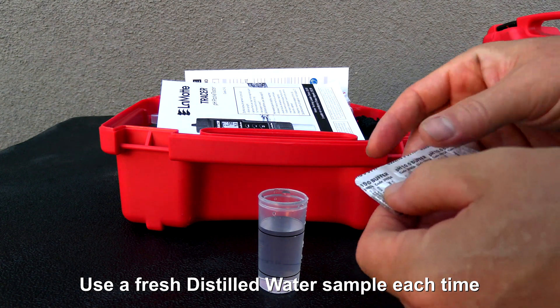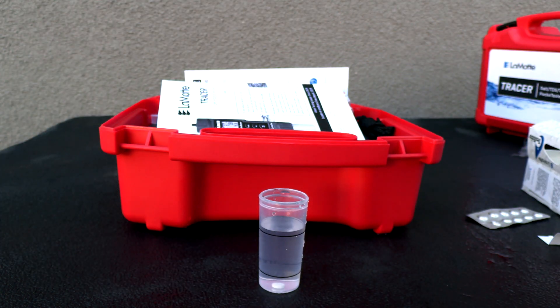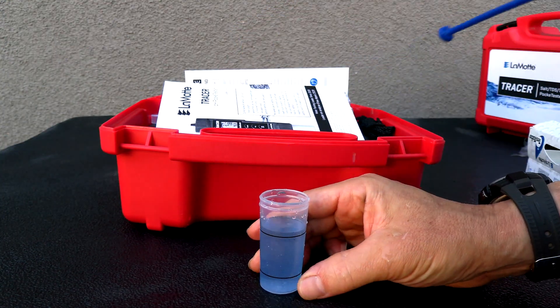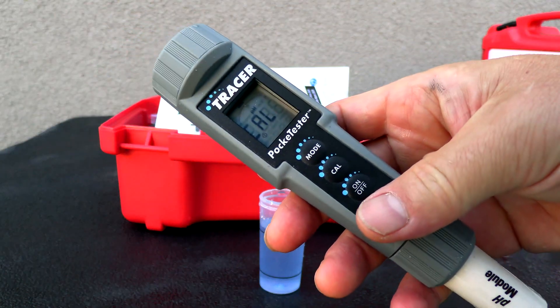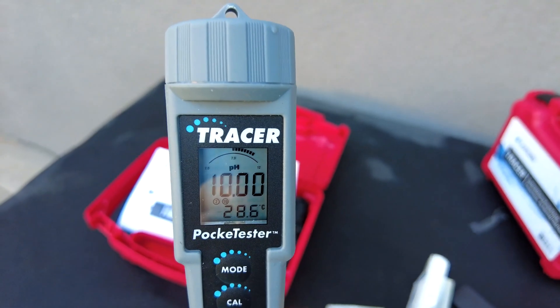It's displaying that the PH is at 7. Now I'm going to put a PH10 tablet in and crush it up. Follow the same procedure — go ahead and hit the CAL button. You'll see it displayed on the screen, and it's showing a PH of 10.